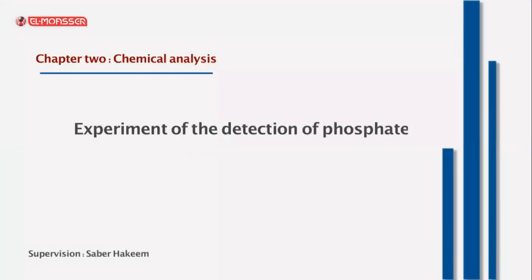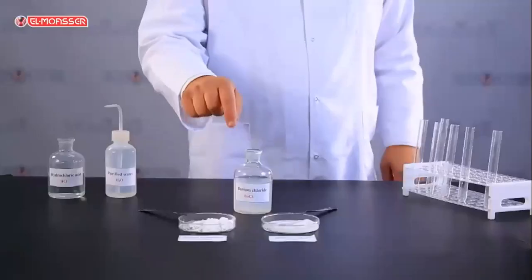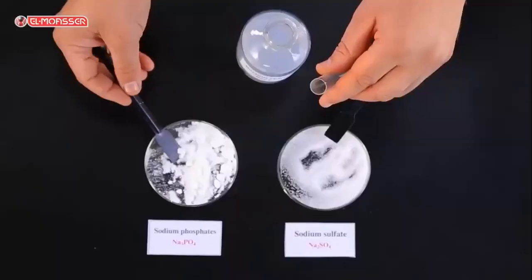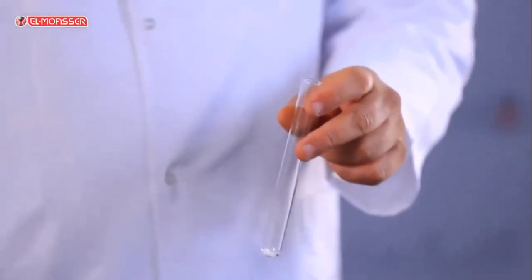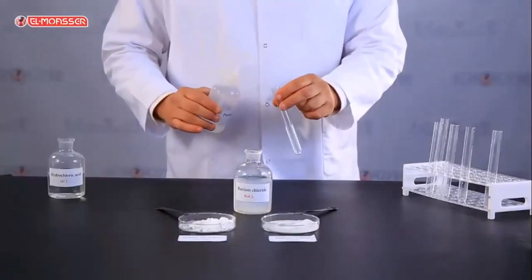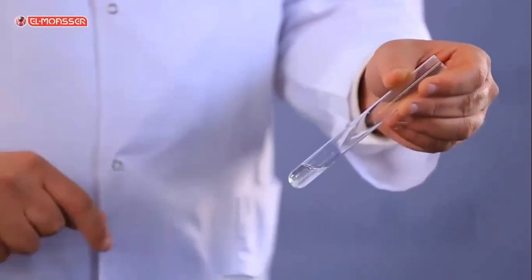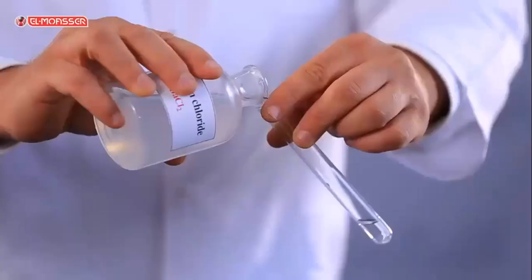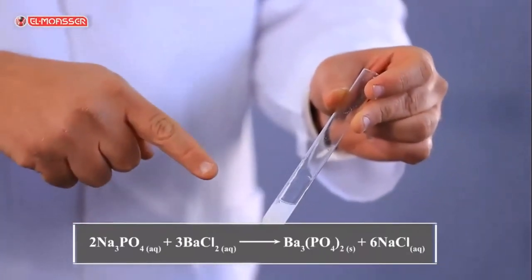Experiment of the detection of phosphate and sulfate anions. The main experiment to detect phosphate anion. Phosphate anion will be detected by using sodium phosphate salt. Transfer a small amount of sodium phosphate salt in a clean test tube. Then add distilled water with shaking to form a solution. Add barium chloride solution to sodium phosphate solution. What do you observe? A white precipitate of barium phosphate is formed.